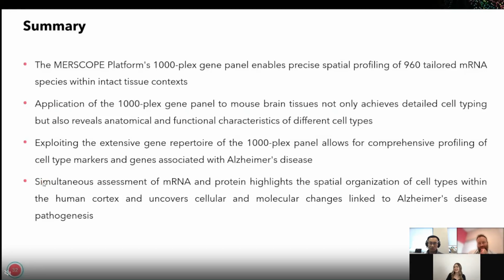Great. Now, how many proteins or antibodies could you stain? So far we support up to 6 different antibodies combined, but they need to come from different species.